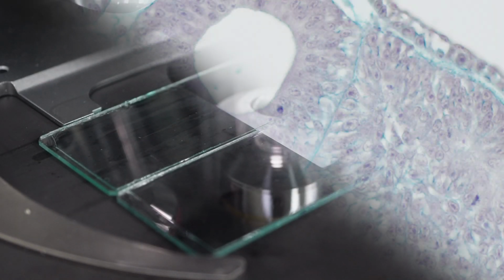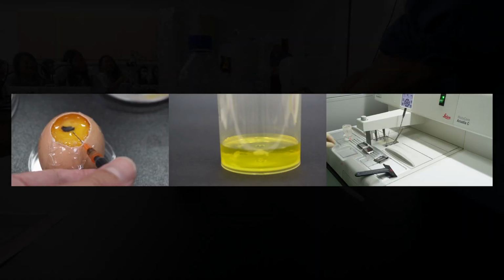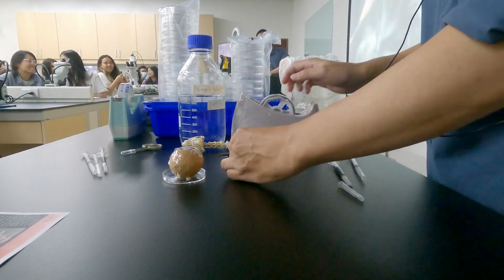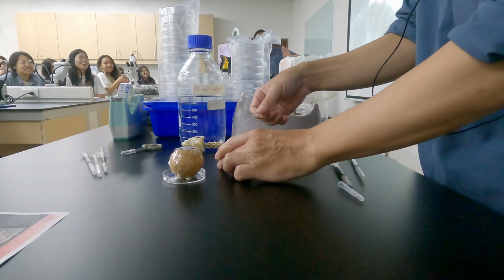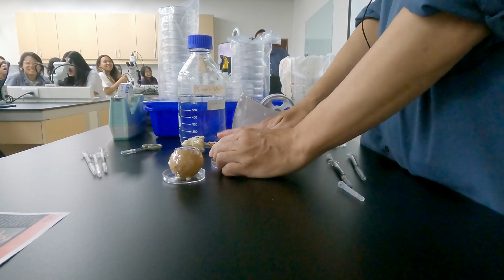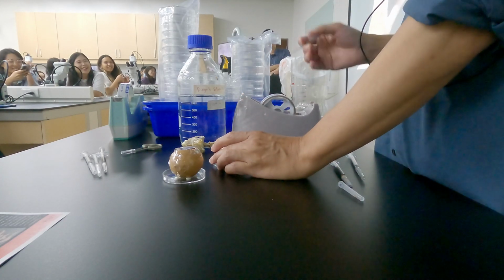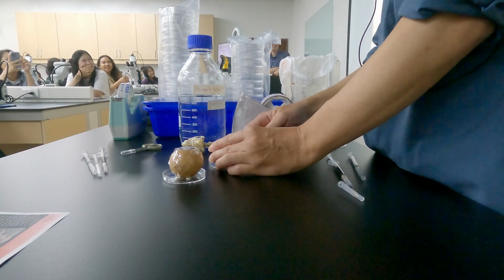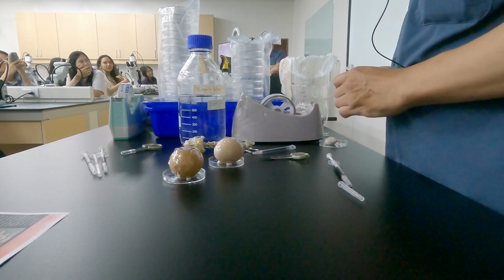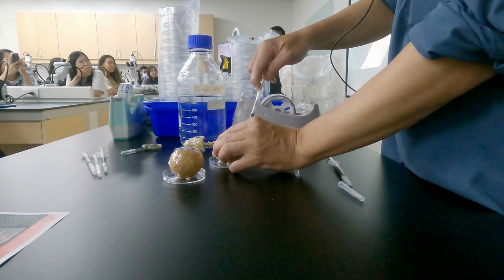A powerful learning tool. Okay, so that really walks us through the whole intricate process, step by step, from a humble egg to these detailed, stained, microscopic views. It's quite something. It absolutely is. And like the guide suggests, actually going through this whole hands-on process gives you a truly tangible sense of how development works. The precision needed, the visual reward of seeing clear tissue structures. A tangible sense? Yeah, because you physically interacted with it at every stage: handling, fixing, slicing thinner than paper, staining. It makes those abstract concepts feel really solid. It takes developmental biology out of the purely theoretical realm and makes it physical, visual. You connect with it differently.